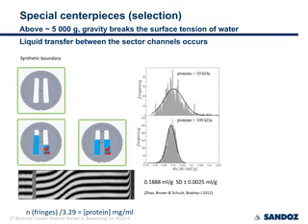You can convert it directly to protein concentration in mg per ml without diluting your samples. So you may analyze, let's say, a formulation at 50 mg per ml and get the concentration directly. If you use lower concentrations, which also permits the recording of an absorbance signal, you can determine the extinction coefficient. I'll show you an example in a few slides.